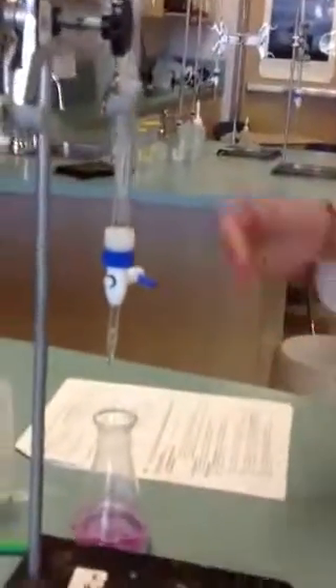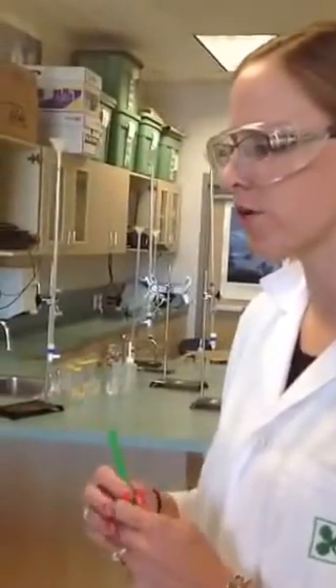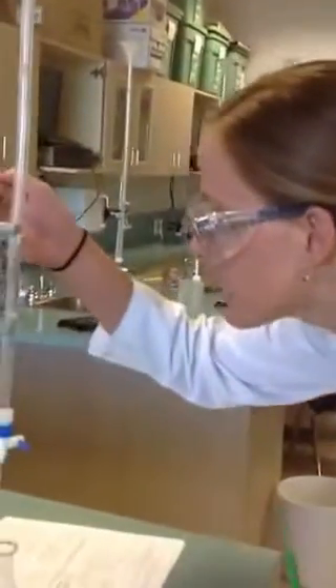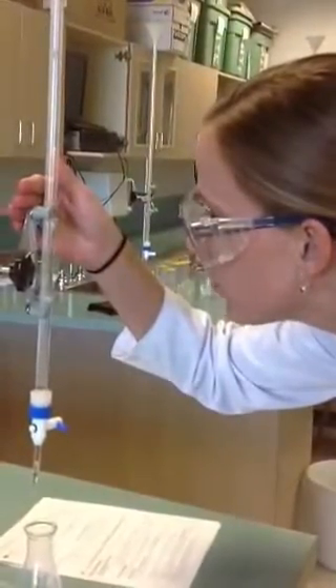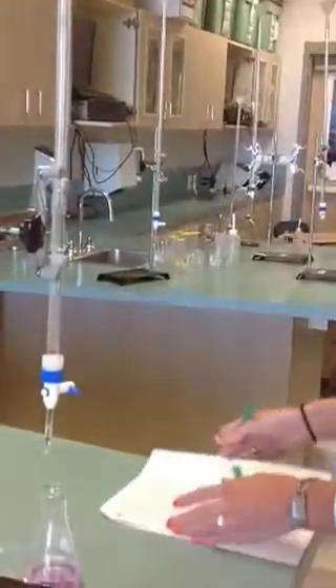At this point, once the color starts staying put, you might want to read your burette so you know how many mils it actually took — just in case you go over on your next titration, you'll know when to really start slowing down. My burette is reading 32.7. I would put that into my data table, and then I can calculate the total amount of my base.